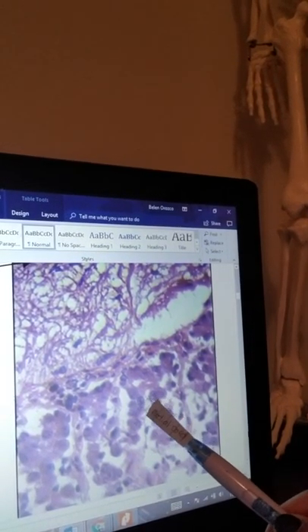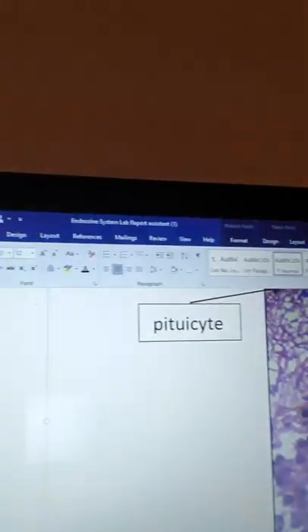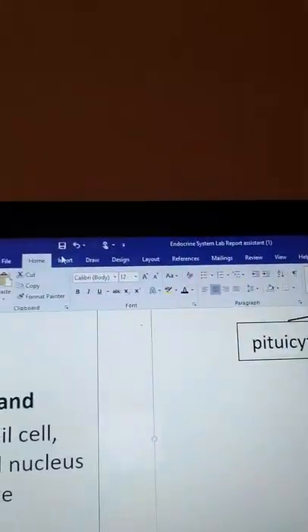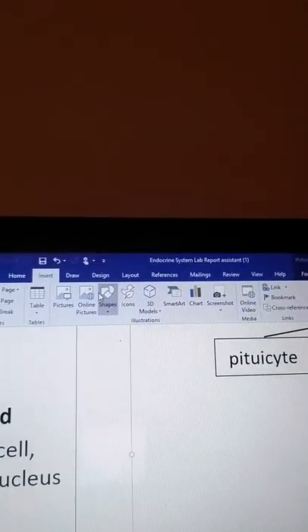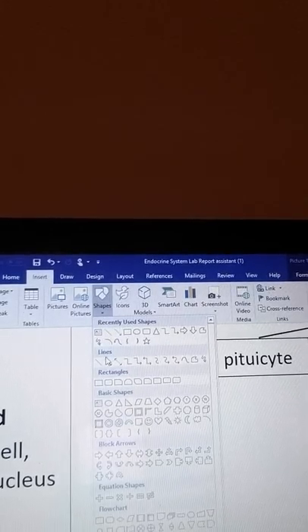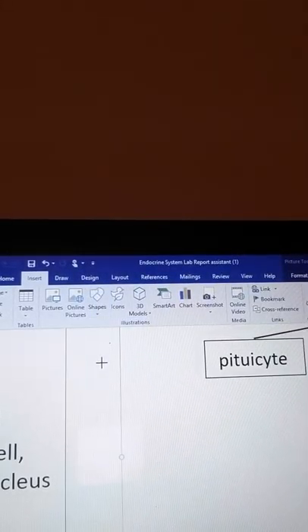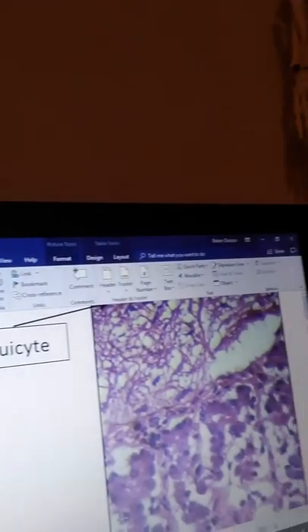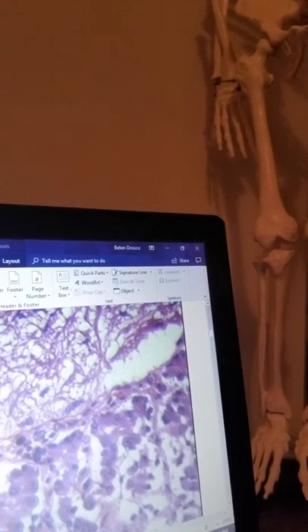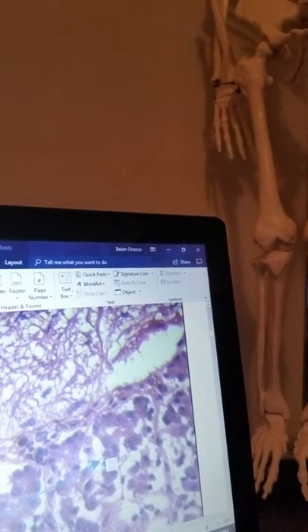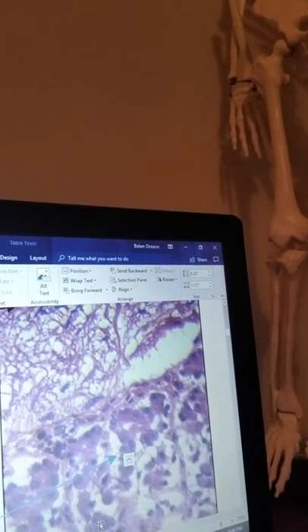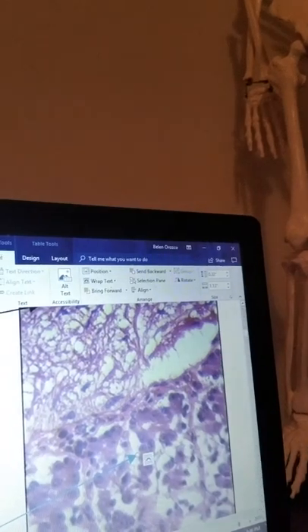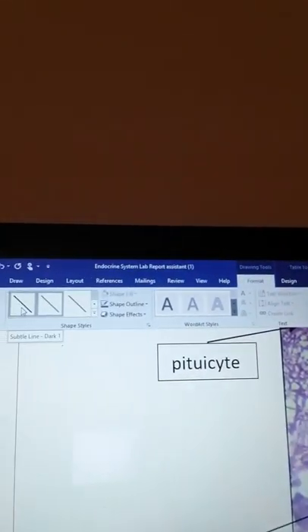So I'll go ahead and go to Insert, Shapes, Lines, Line Arrow, and draw my arrow where I believe is the acidophil. Go ahead and change it to black and it's pointing right at it.